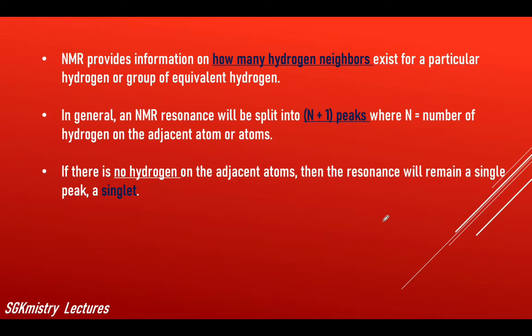So now how will the splitting take place? With this NMR spectroscopy, we can identify how many hydrogens are present next to the particular hydrogen which we are studying.